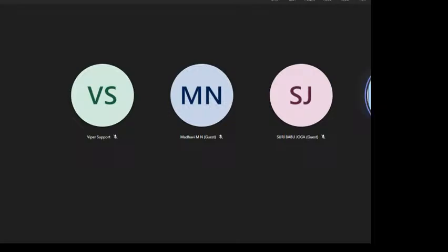So when the FDA or these regulatory bodies come, they do not look at the data we give. They look at the data they have. If there is a difference between the data we gave and their data, what is the reason why on so and so date, so and so chemist repeated that experiment? Why did you get this result? The result is like that, but it is showing like this. So there is regulation, and sometimes they will cancel the entire batch. So that is why the regulatory industry is very difficult and also has a lot of profits.